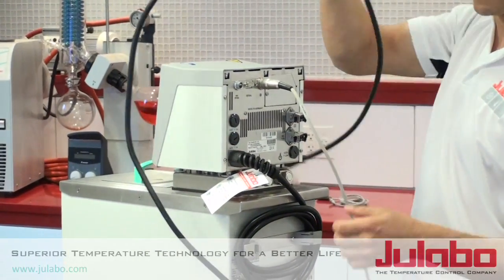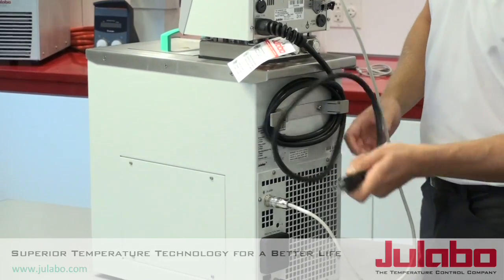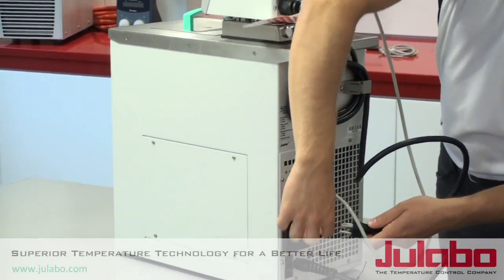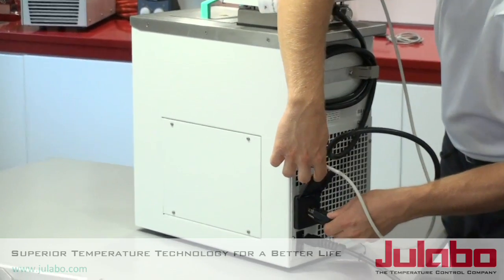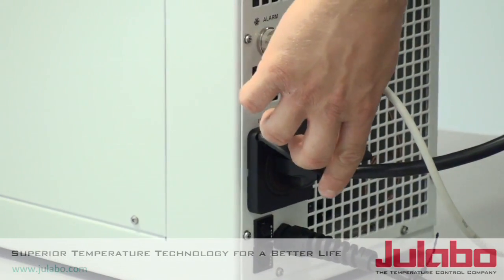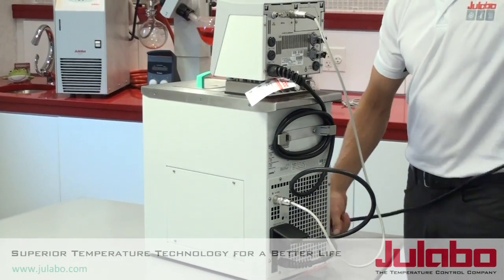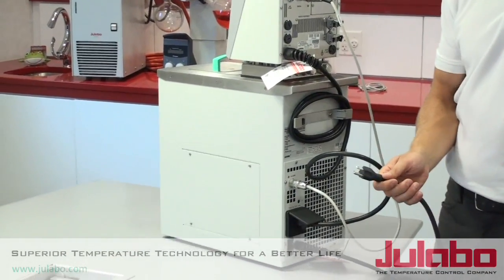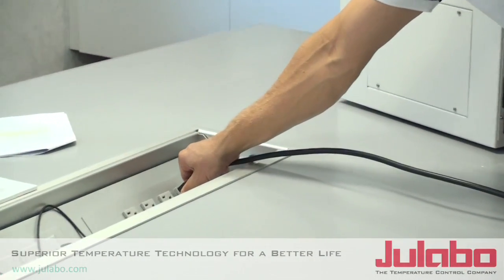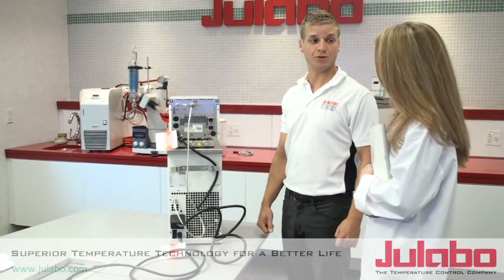Next we want to connect the electrical cords. There are two cords here on this series. We want to make a connection between the circulator head and connect it into the compressor. Then take the power cord on the compressor and plug it into your outlet or receptacle. Now we are ready to turn on the unit.